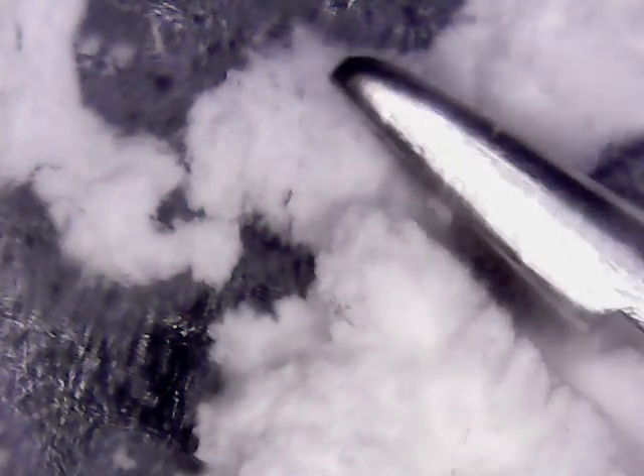Wow, that's just what that looks like. Who knew that cornstarch looked legitimately like snow? Yeah, that's in focus. I thought it was out of focus and it was just looking funny. No, it looks like... oh.